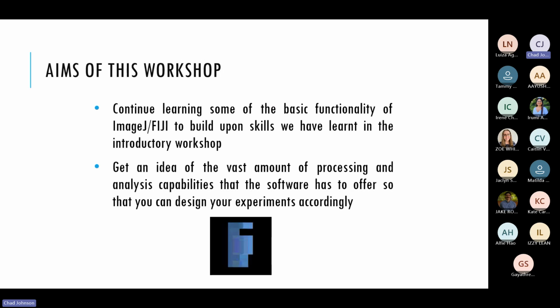As it's an open source system and the community for FIJI is huge, people are always writing plugins and scripts. You'll often see them in papers when you're reading through: we used XY plugin, or we wrote XY script that you can then request. I've never seen any that are actually commercial that you have to pay for. They're typically available because it is an open source system. Most researchers are happy to hand off the script that they've written, with of course an acknowledgement if you use it for your own research.